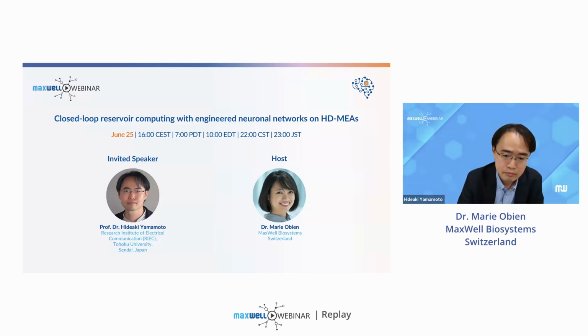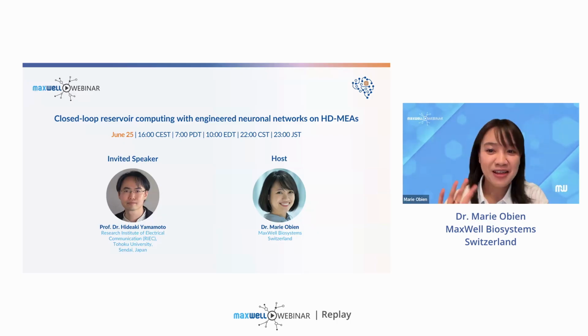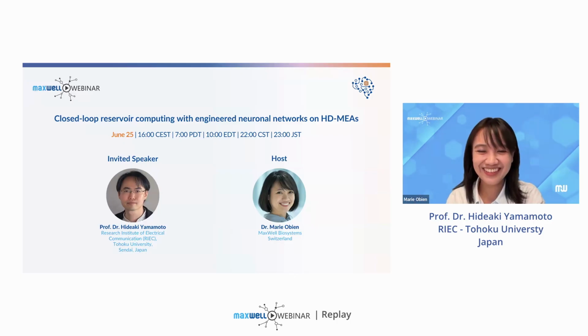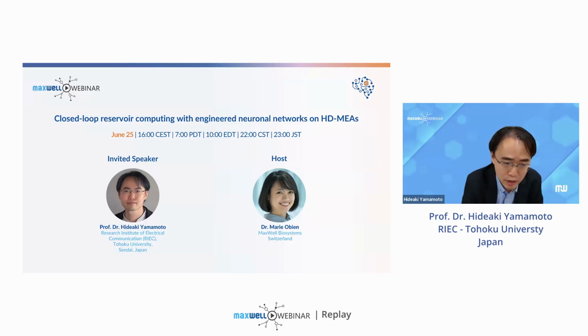Yes. Next question, Vias. Hello. Does the geometric organization of neurons matter? I mean, the nervous system of all animals is 3D. It should. So I guess we're looking at what we can do with 2D as of now, and going on to 3D is of course interesting, but there are a lot of challenges in terms of culture and also the recording that needs to be done.